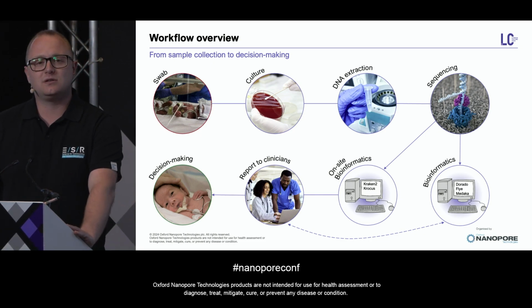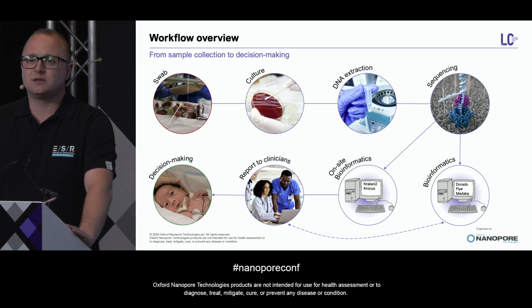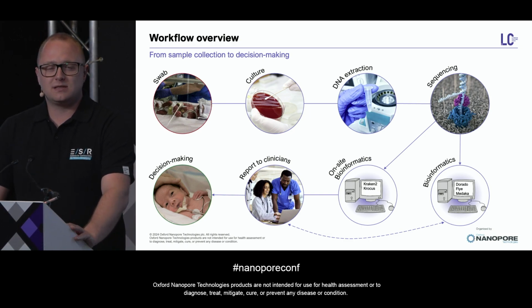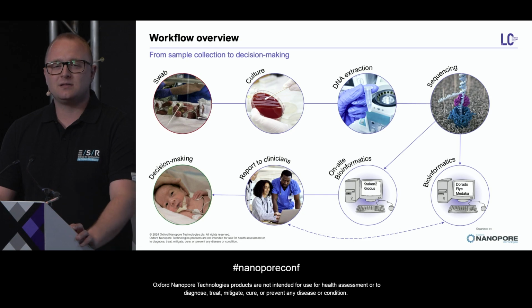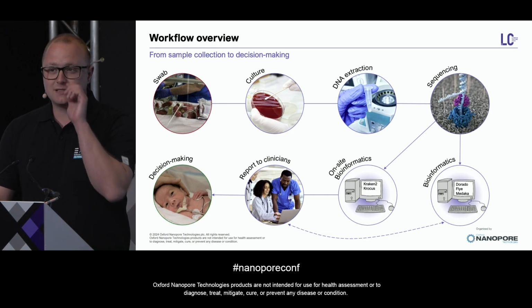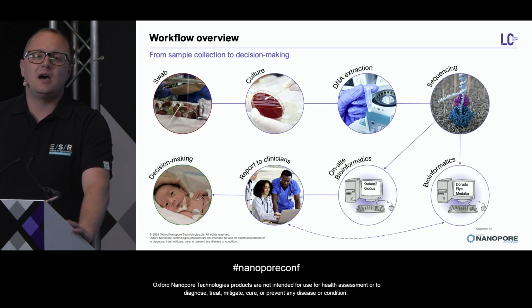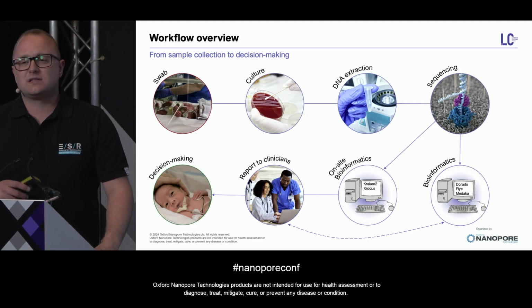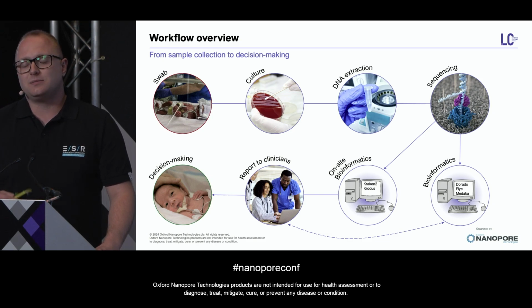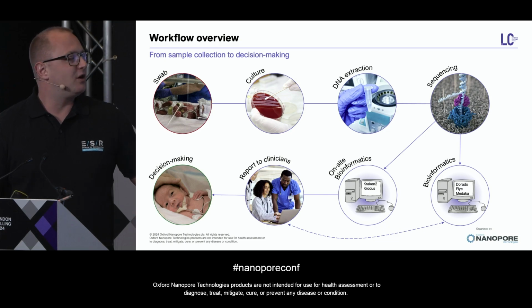For the hospital, they are really concerned with a species ID and a multi-locus sequence type. By multi-locus sequence type, or MLST, that's a typing scheme where we take 7 conserved genes, and that's species dependent. Then depending on the nucleotide sequence of those genes, we can assign an allelic profile to them, and henceforth a sequence type. Once they have a species ID and a sequence type, that gives them information on whether or not there is an outbreak in a certain region or area of the hospital.